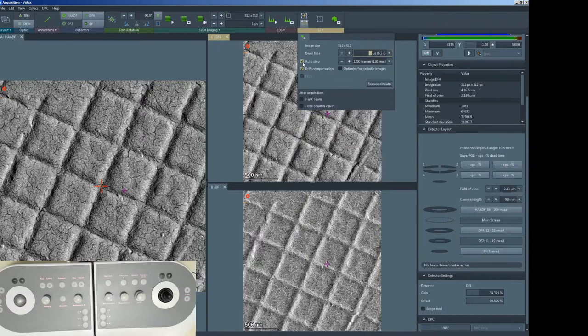And here you get auto stop. If you check this box, it's gonna stop after it reaches the settings over here. So right now it says 1,200 frames. So at 1,200 frames, it will stop. I usually don't use this function, so uncheck it, because I always stop it manually whenever I think the result is good enough.